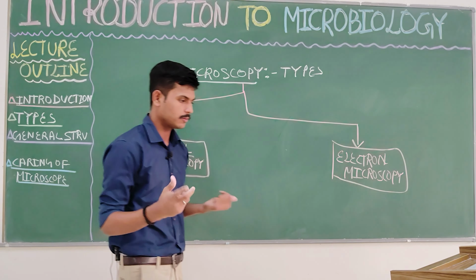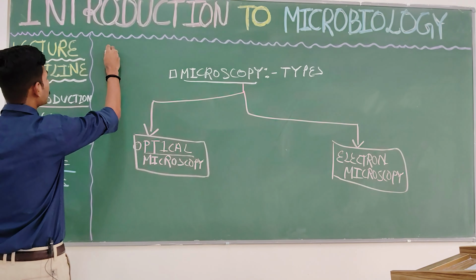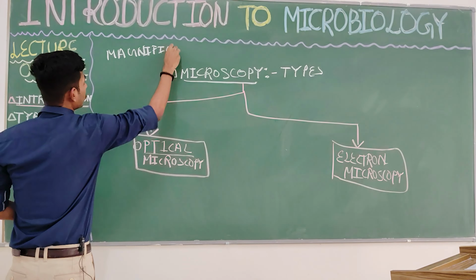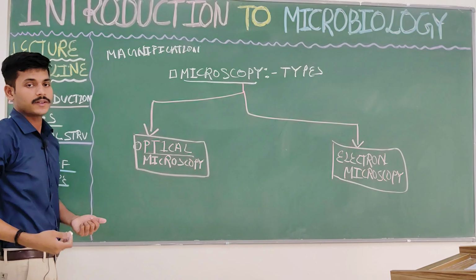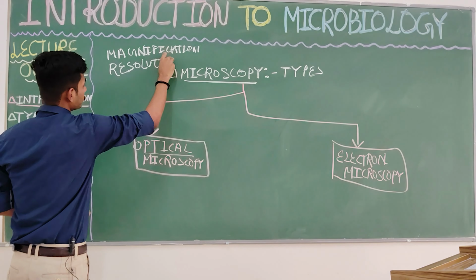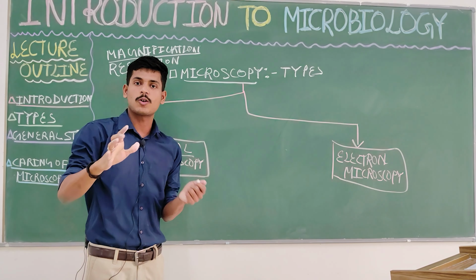First be clear about these two terms: magnification, and another one which is frequently used when you describe the microscope, called resolution.